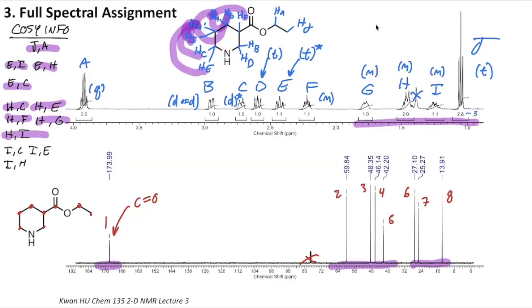Whew. Okay, that's a big old mess of highlight peaks. Let's get rid of a few of those. So that's one of the things that's a little bit weird about this particular example: those H protons being right on top of each other makes it a little weird and gives a lot of these different cross peaks. But I think all in all, what we've got so far makes really good sense.